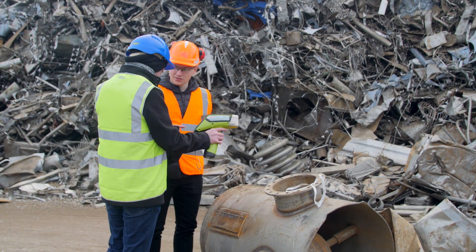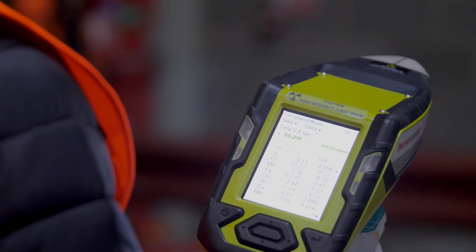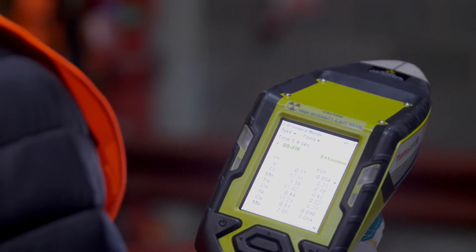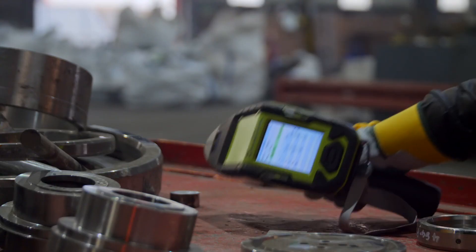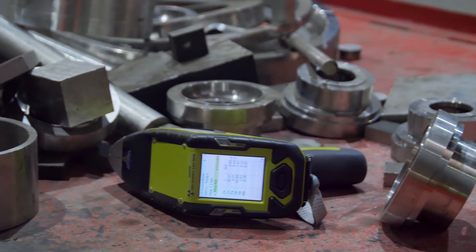We have over 20 of the Niton analyzers in use here in the UK alone. We find them extremely useful. They keep us at the forefront of a changing world. They help us on an hourly, a daily basis. They are an integral part of our business.